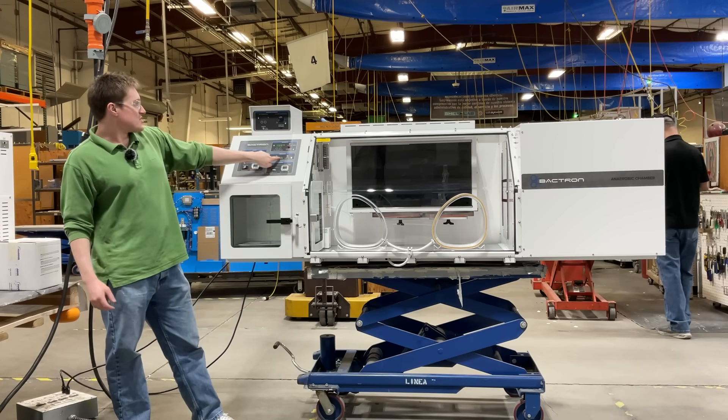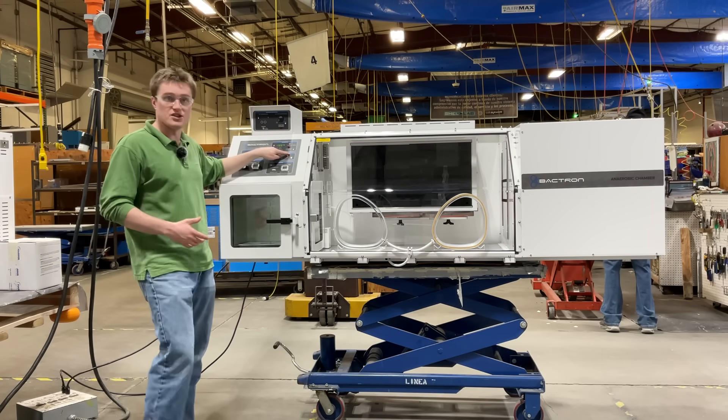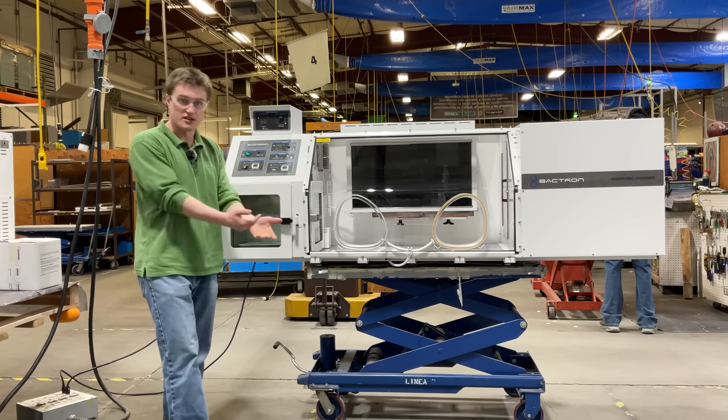Moving below, you will see the two indicator lights: one for a commission cycle in progress, and the other to tell you that AMG is being injected into your chamber.